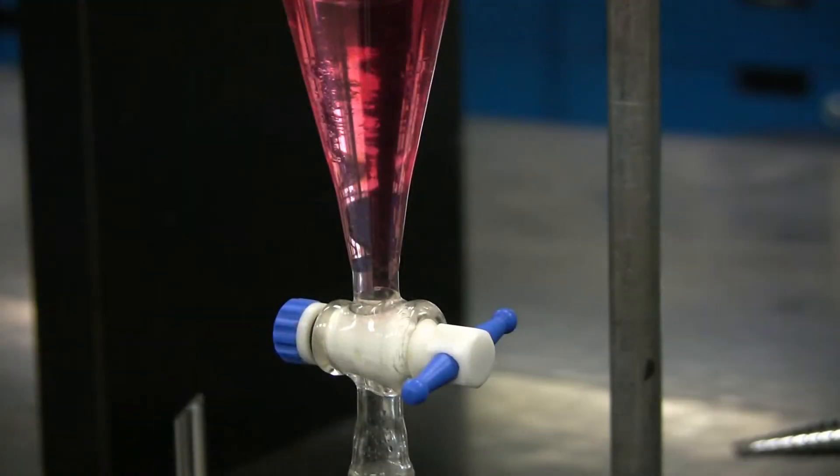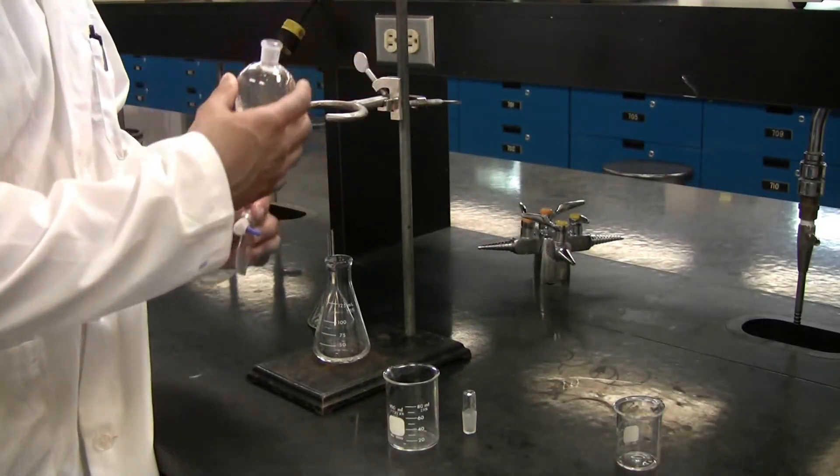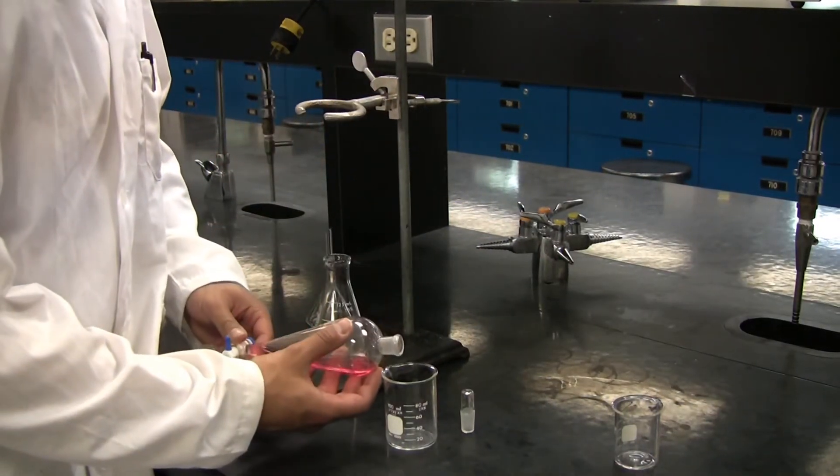When you're close, it should look something like this. Drain the second layer out of the top of the separatory funnel into a separate, clean beaker.